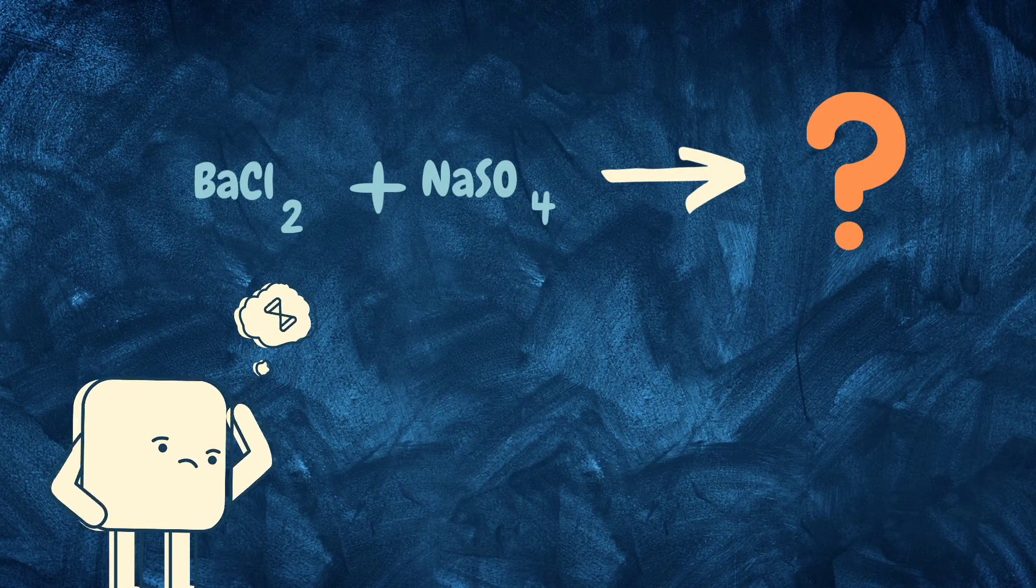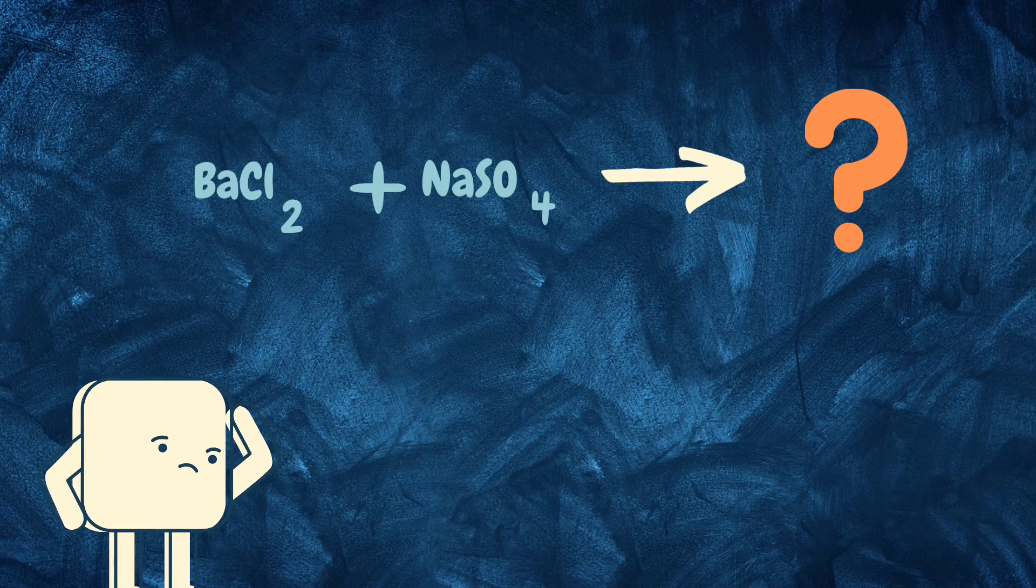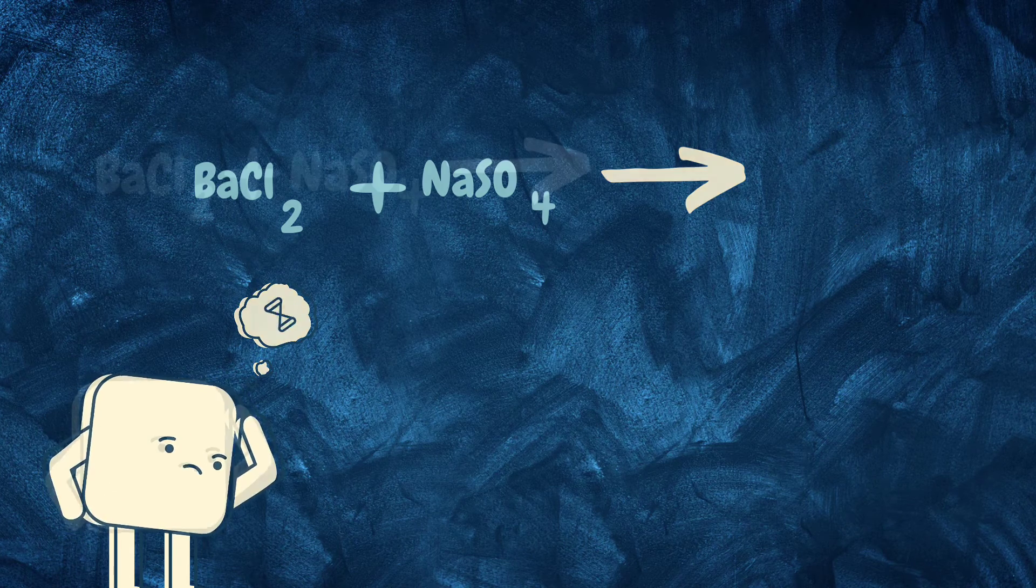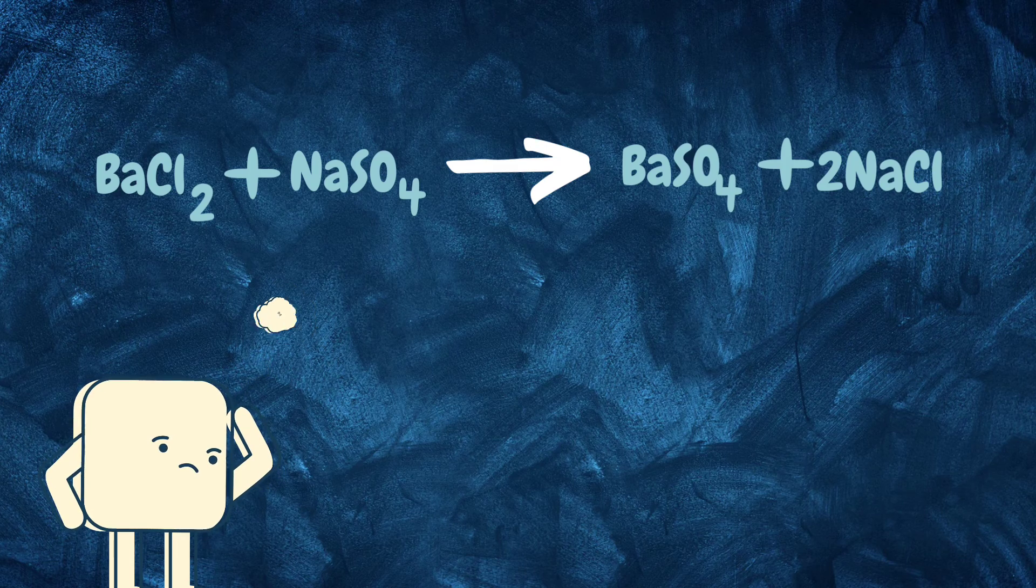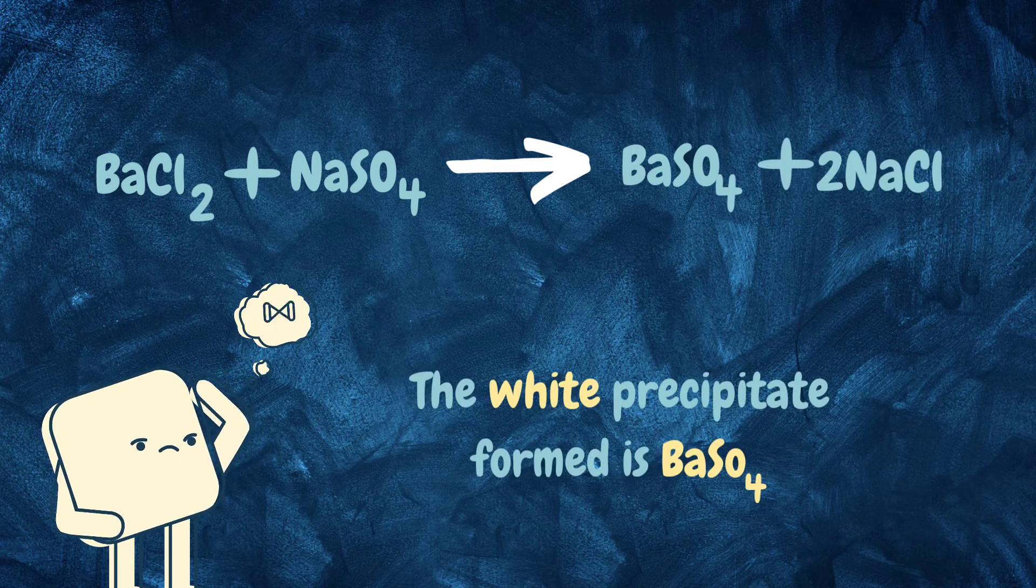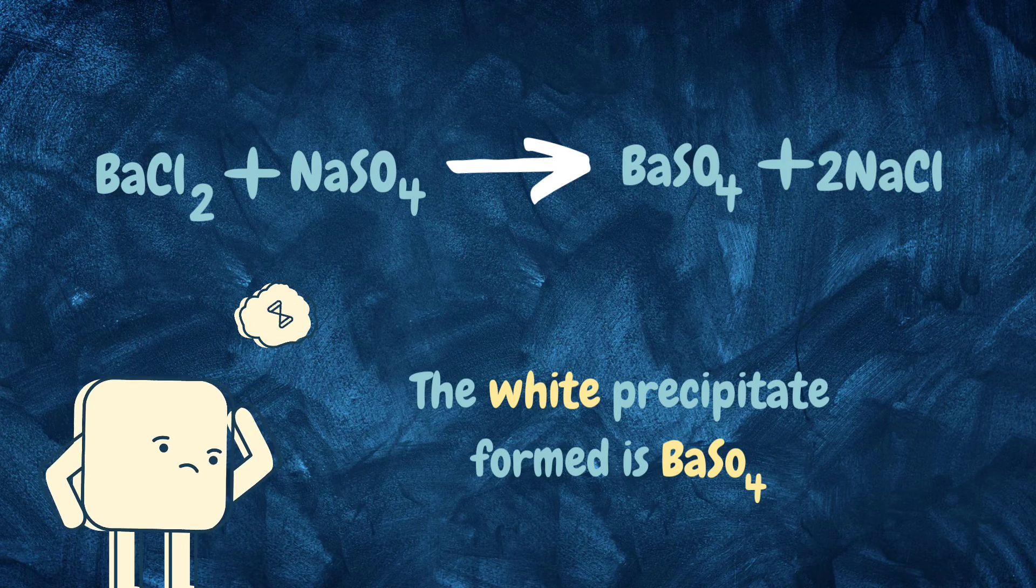After the chemical reaction, a white-colored precipitate is observed. Can you guess what this white precipitate could be? The products formed are barium sulfate and sodium chloride. Out of which barium sulfate is the white precipitate and insoluble in water.